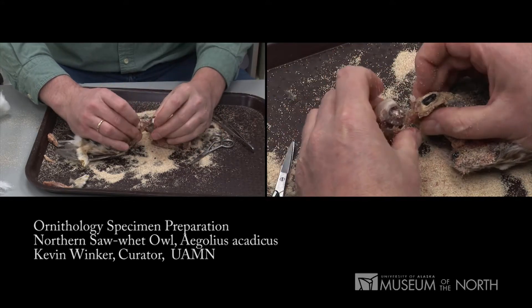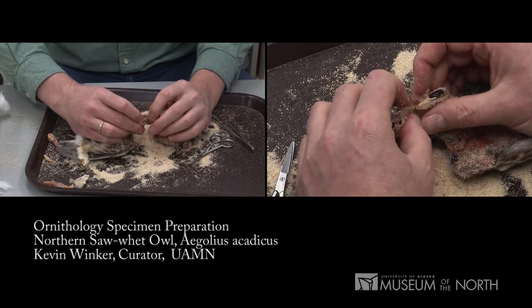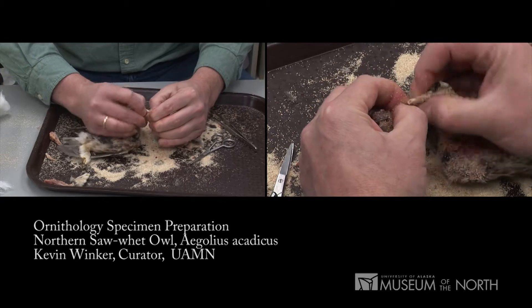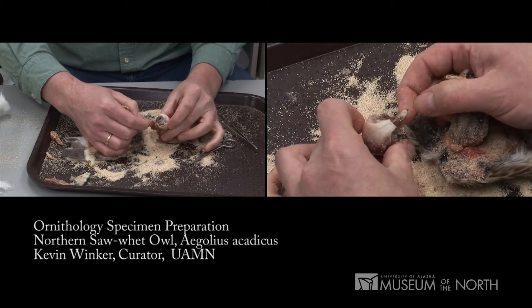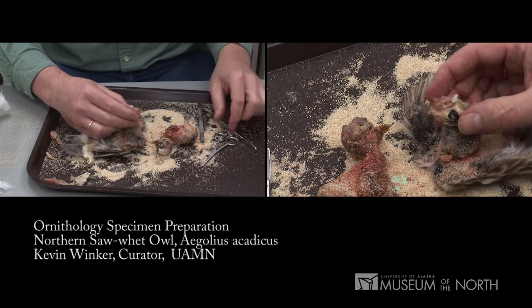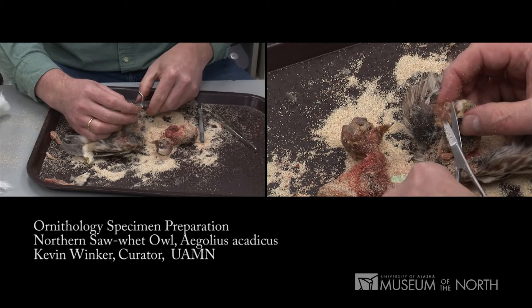I'm carefully pulling those apart now, and there's a tongue in there. There are tongue bones which will keep with the partial skeleton. I need to grab onto that and remove it. There's the tongue and the partial skull with the skin separated right out to the base of the bill.